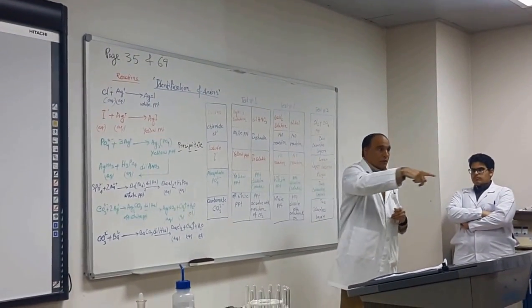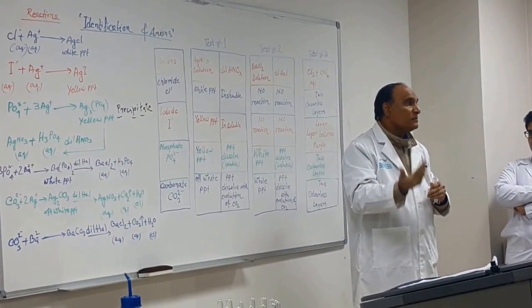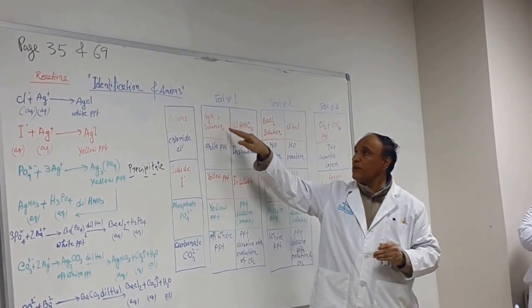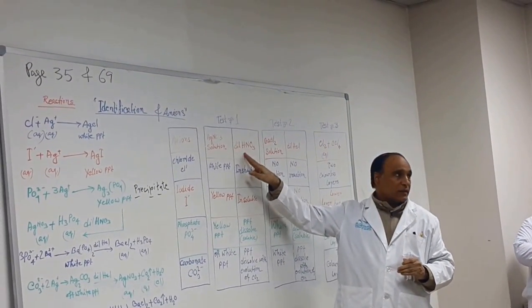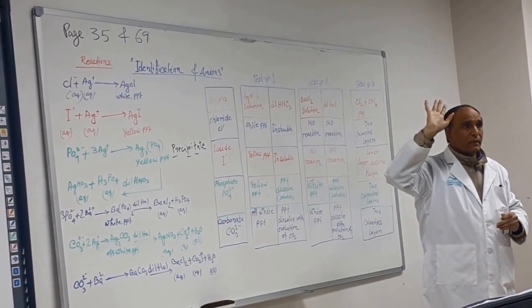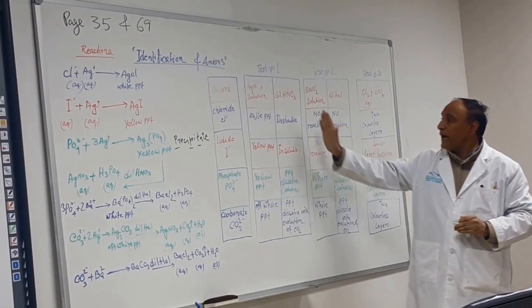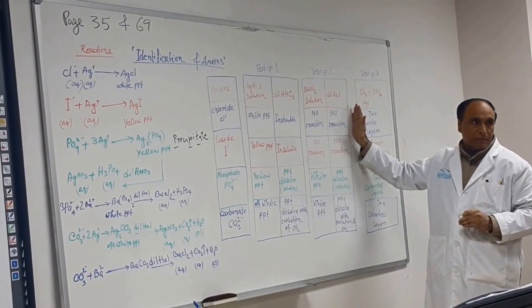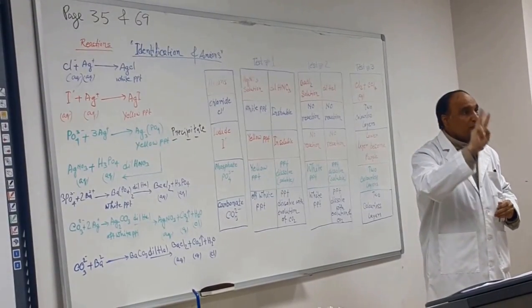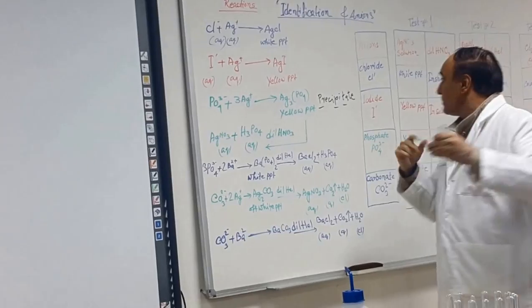The gap is not in the book. They are joined together. And last year I saw some students, they take chloride, then they put silver nitrate, then dilute nitric acid, then barium chloride, and in the same test tube they put everything. So that is why I put a gap. So that it's not in one test tube, you will do it in 3 test tubes. Now I have finished with chloride.